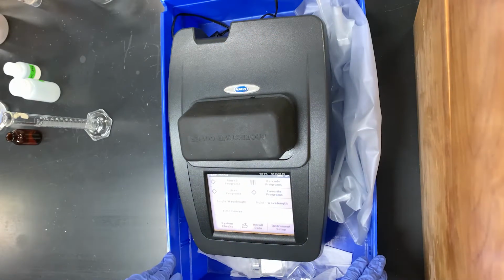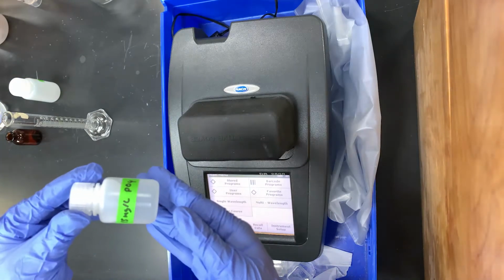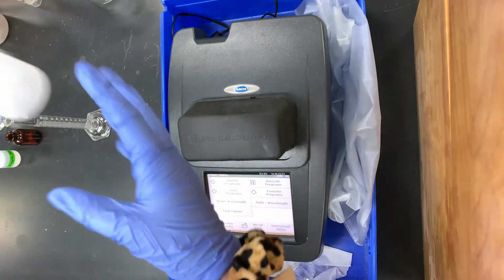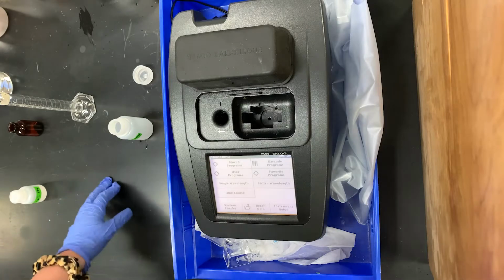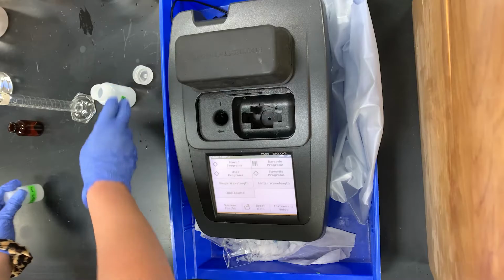So as you guys saw in the assignment online, we're making a bunch of standards today of phosphate that range from 15 to 1 milligram per liter. All of the standards will be made from a 15 milligram per liter standard, as I have here for this demonstration, and I will just be showing you how to make the 1 milligram per liter standard of phosphate. For this demonstration, I will just be using phosphate standards of 1, 2, 5, and 10 milligrams per liter.